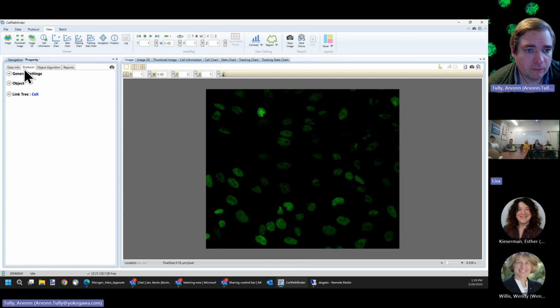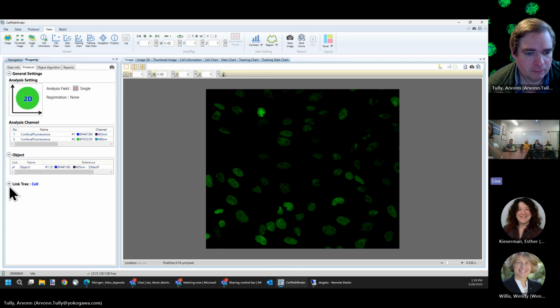There's also the data. Go ahead. I just wonder, is there a way, before you take that snapshot, to set a scale bar as well?